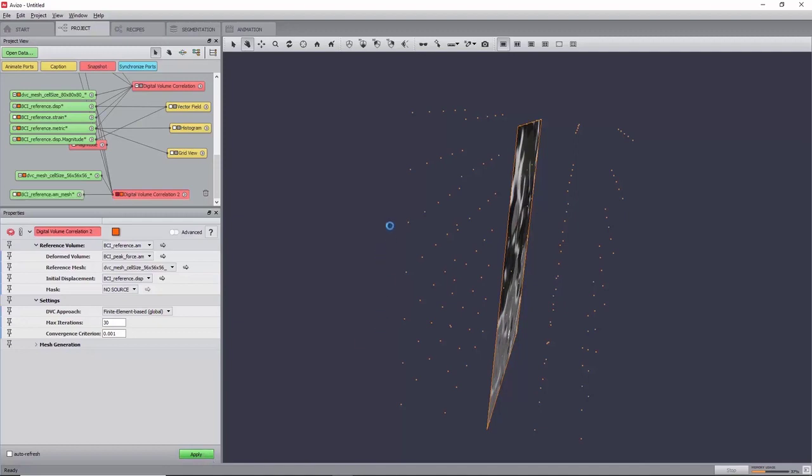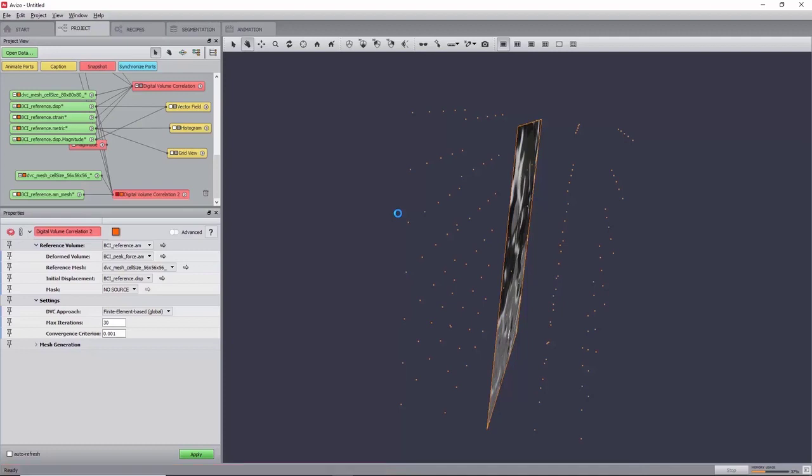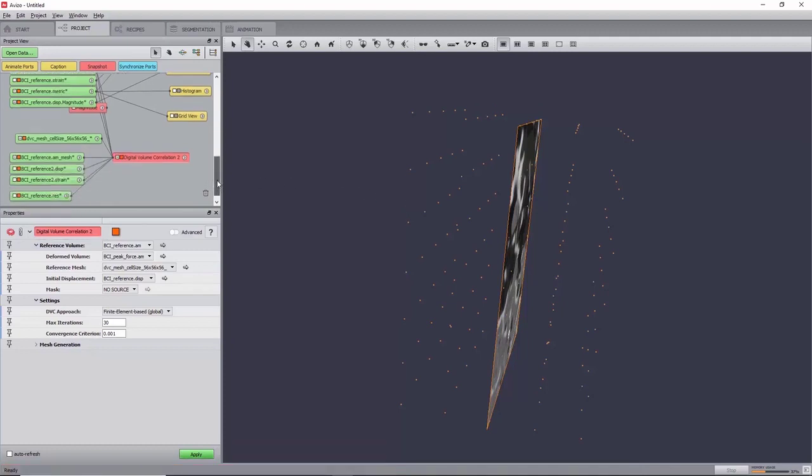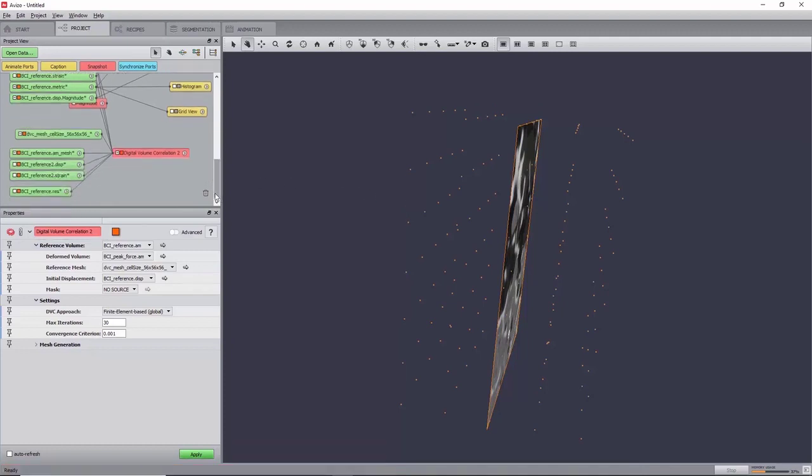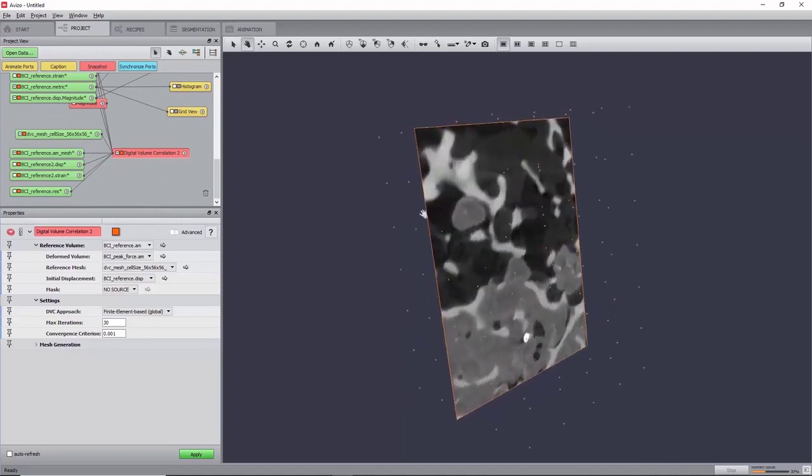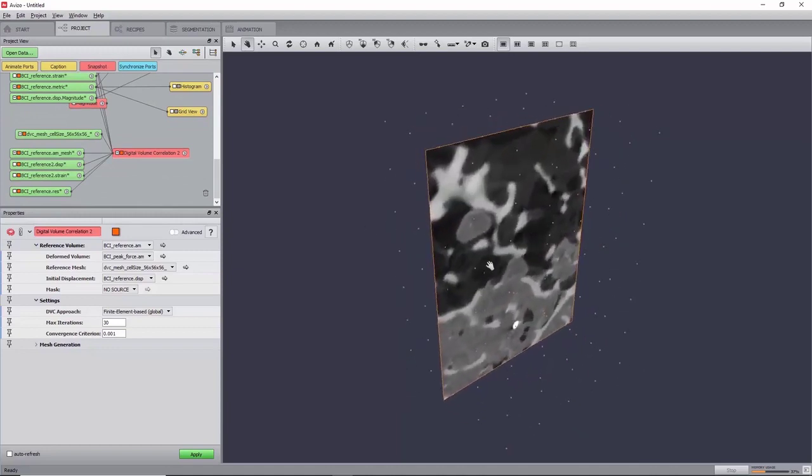Similarly to the local approach, this will create a displacement field and a strain tensor, but unlike it, it will also create a residual image instead of a metric map. In this global approach, the displacement field is obtained by minimizing correlation residuals, which corresponds to the difference between the reference image and the deformed image corrected by the computed displacement field.